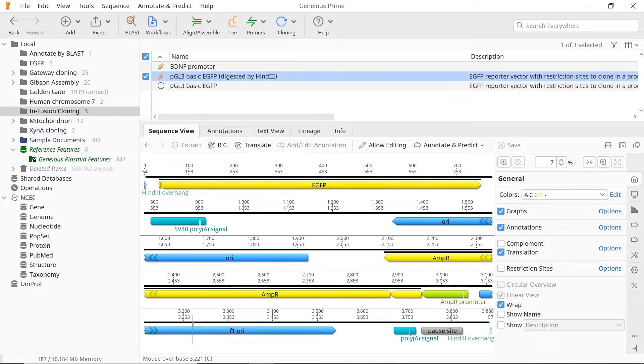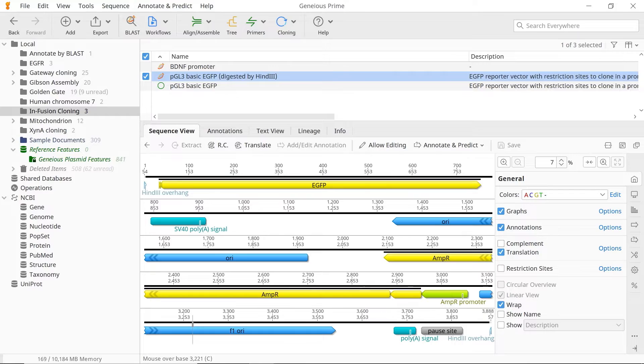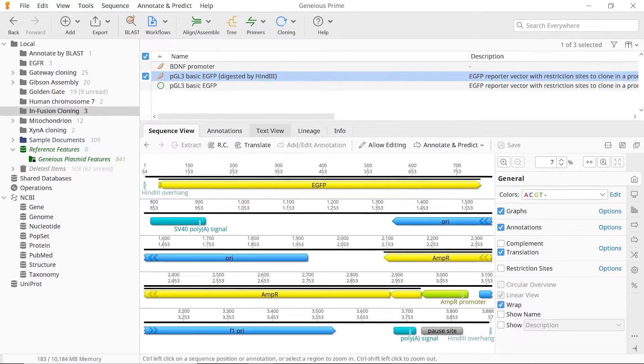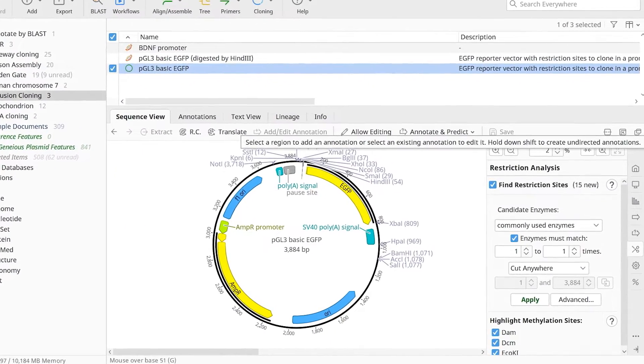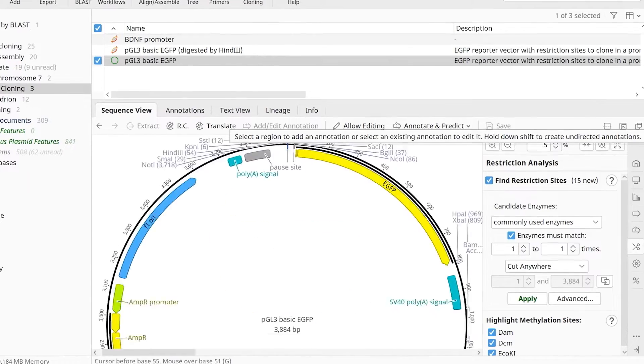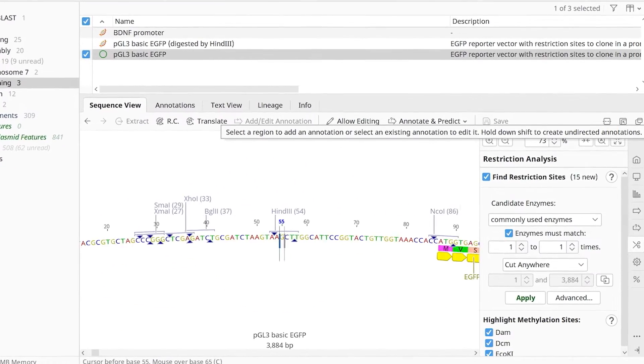Alternatively, you can use inverse PCR to linearise your vector. To do this, select your circular vector file and zoom into your desired cloning region.